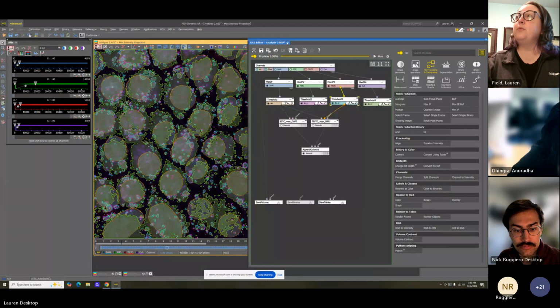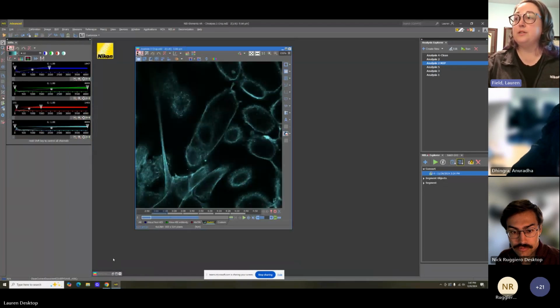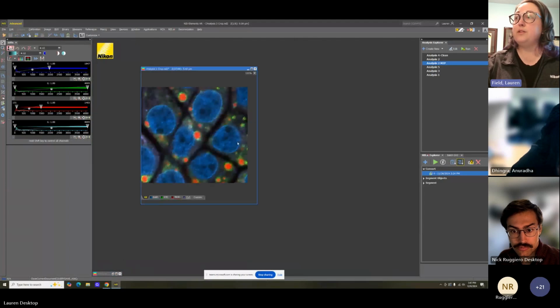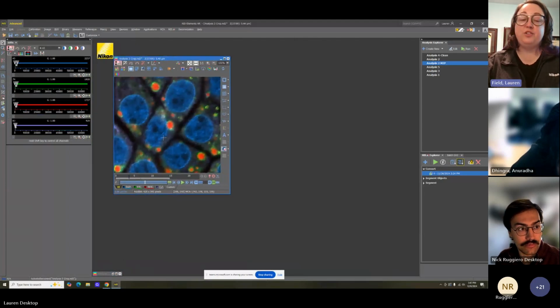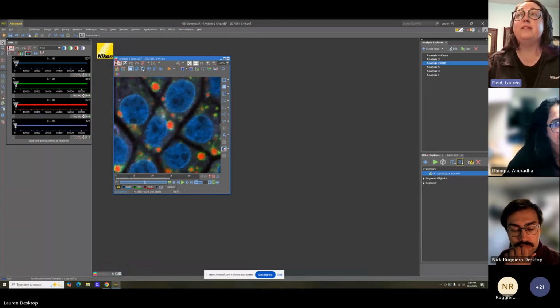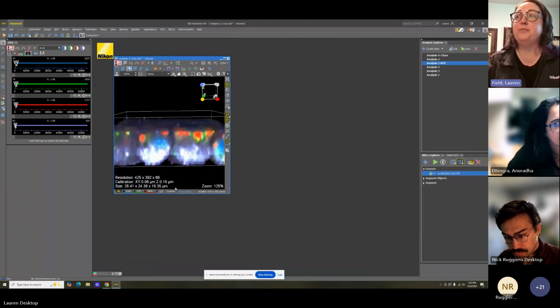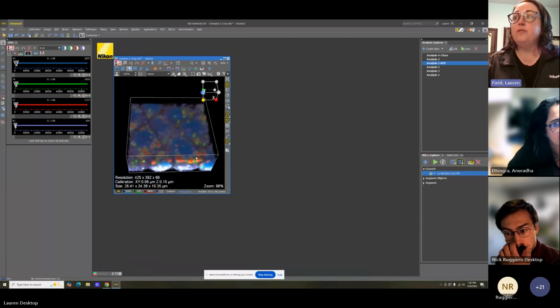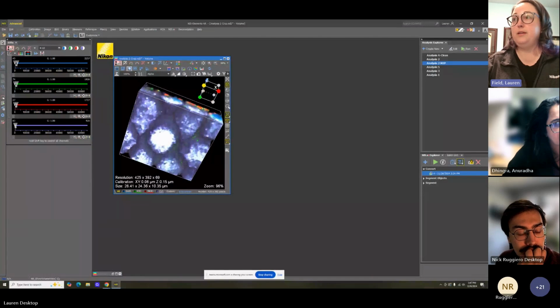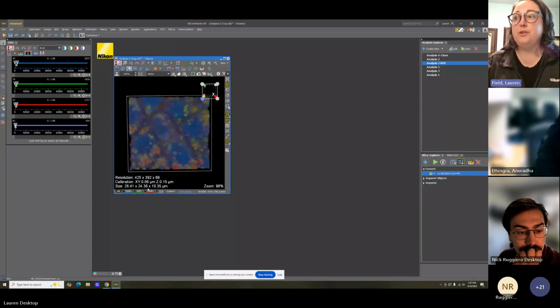What's fun about GA3 when you have our volume analysis is I have a cropped version of this picture. So I have cropped it just in XY so that I have a smaller number of pixels that the 3D volume has to render in order to create the preview image. Otherwise, you're going to be sitting here waiting for it to continue to re-render your picture. So you can see from this volume that the purple is really bright near the bottom and then kind of becomes this hazy structure up near the top.